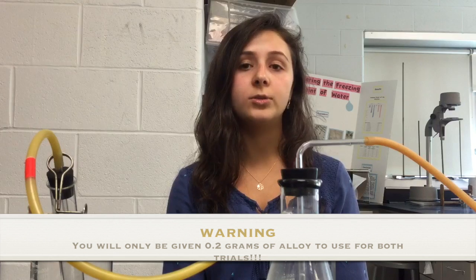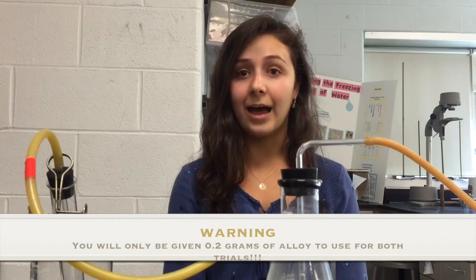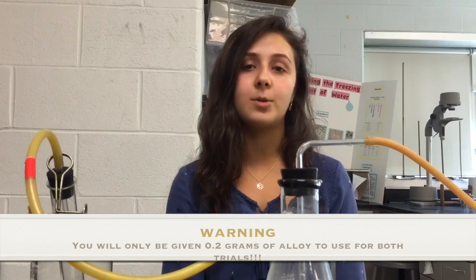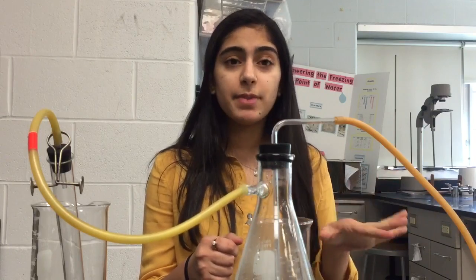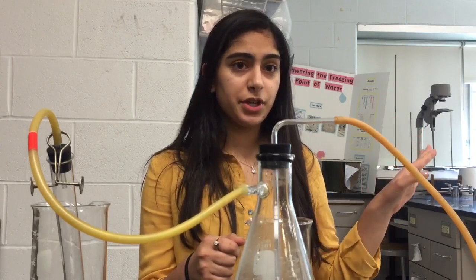You need to do two trials, but you only have a limited amount of the alloy, so be careful and choose wisely with how much mass you use at a time. Once you have finished your trials for both alloys, make sure to clean up your lab and put away all your materials.